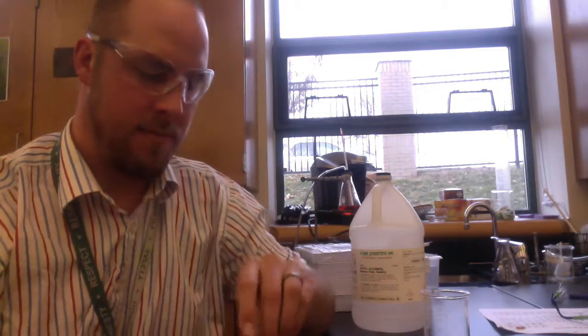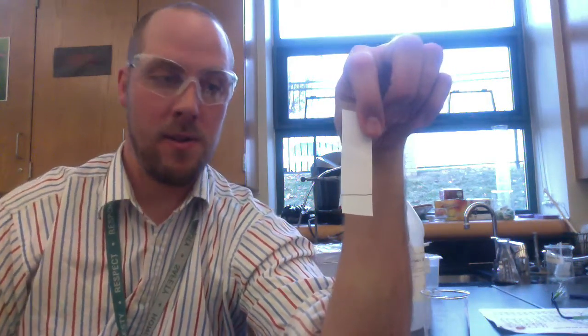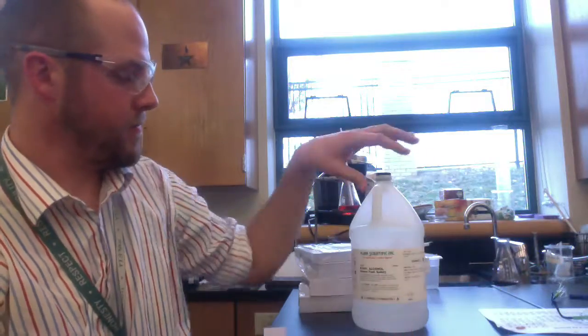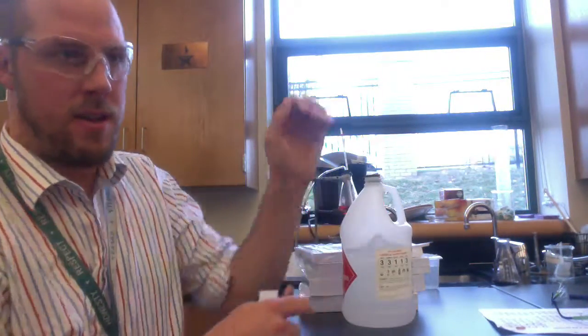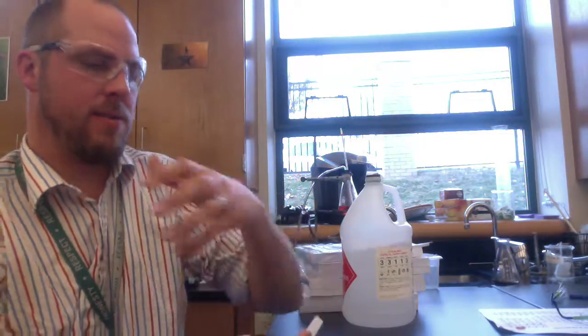What you're going to do is on the bottom of this paper, make a nice little line across the bottom. It's a good idea for you guys to check out the Google slides that introduce covalent bonding and the idea that some molecules end up sharing electrons rather than just gaining and losing them like in ionic bonding. So we're studying a few different covalent molecules: water, ethanol, and acetone, which you probably know as nail polish remover. Those are all covalent molecules that are sharing electrons rather than gaining or losing them. And that's going to give them some different properties that we'll be talking about next week.